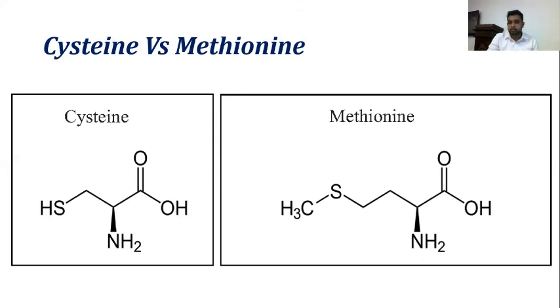Then in the sulfur reaction, amino acids which contain terminal sulfur, that means cysteine, as well as proteins containing it, can give positive results. That means the lead sulfide precipitate. The white color precipitation formed with the other three samples can be other sulfide compounds. I don't know exactly what it is, because I don't know the sequence of amino acids in those samples. It can be many amino acids, and the sequence and the amino acid types are different, and it can be other sulfide compounds. But specifically if there's cysteine, it will form a black color precipitate, that is lead sulfide.